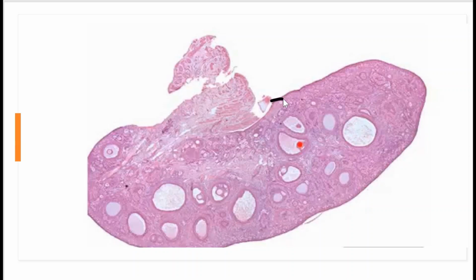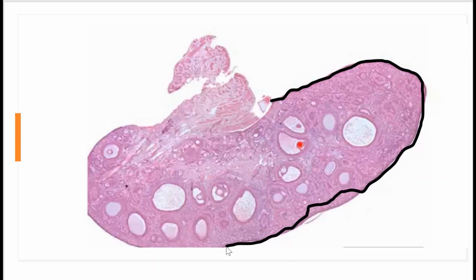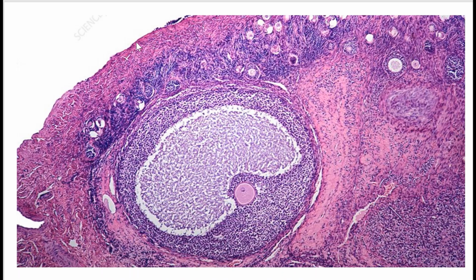And the first thing that we're going to notice is the edge around this ovary, because, whoop, my line's kind of crazy. This is your ovarian mesothelium. Okay, our ovarian mesothelium. The layer right below your ovarian mesothelium, I'm going to show you on here. So if you see this as ovarian mesothelium, right?